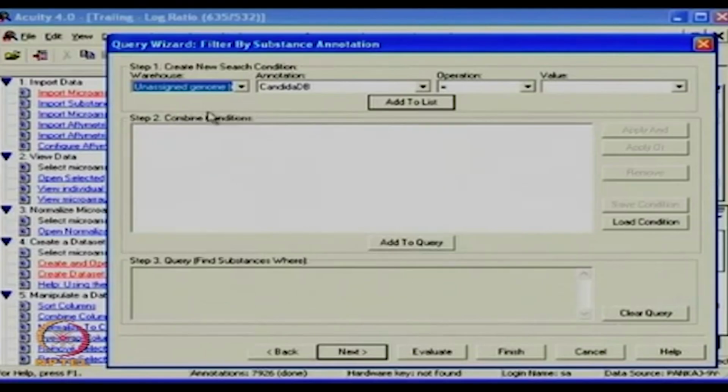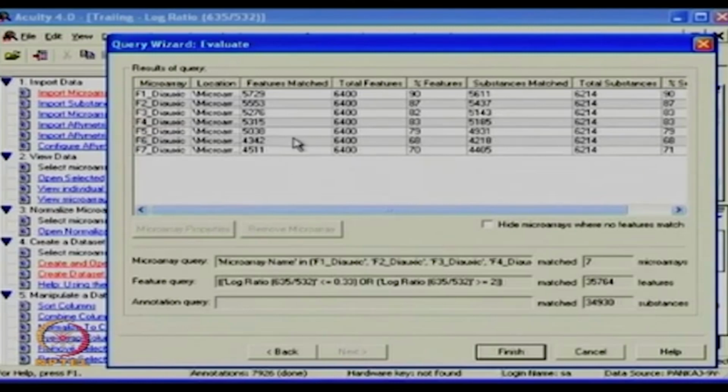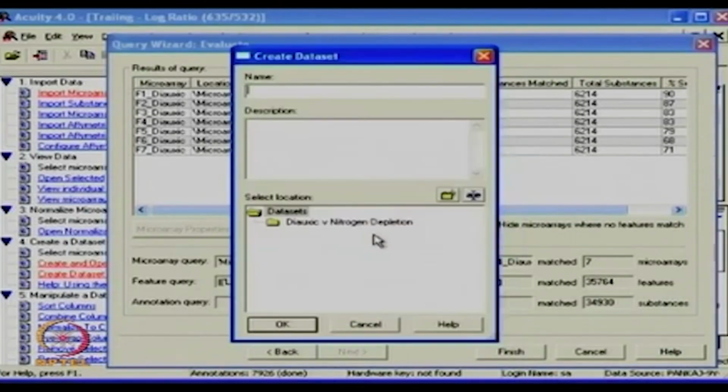You can even select the database on the basis of annotation and filter only those which are mitochondrial specific. So it depends on what questions you are asking. So quickly look at only what you are saying. It shows how many of them are there, so it reduced the numbers. In this fashion, I can import a limited number of entries from the database as well. I can give it a name like filtered and it will be imported.